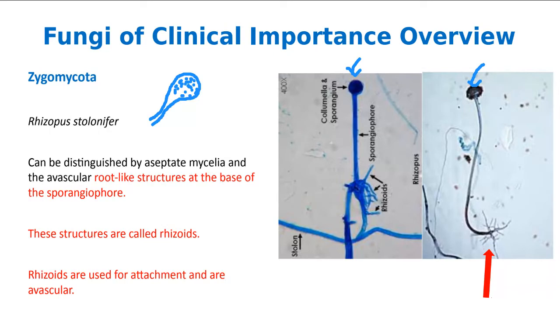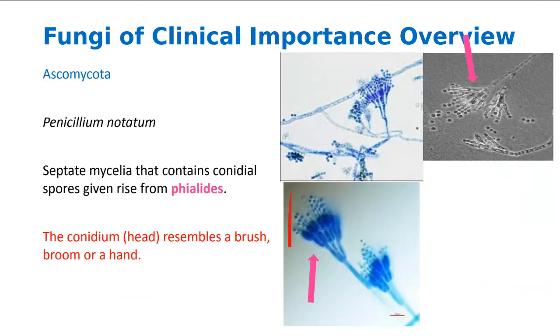Okay. So let's go to, we're almost done. Let's go to the higher fungi, right? And so we're going to talk about 4 organisms, right? Penicillium, Aspergillus, Microsporum, and Coccidioides. Now, all the organisms we have talked about or are going to talk about today are opportunistic pathogens. Okay, the only one that is a true pathogen is Coccidioides immitis, and we're going to talk about it at the end because it's really important.